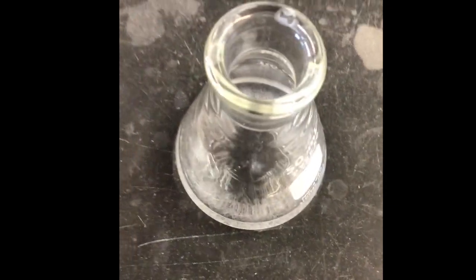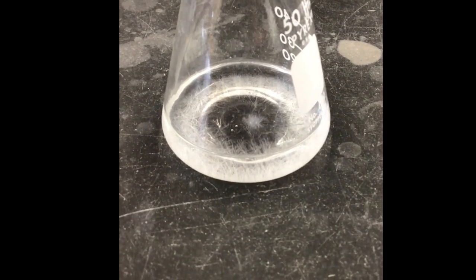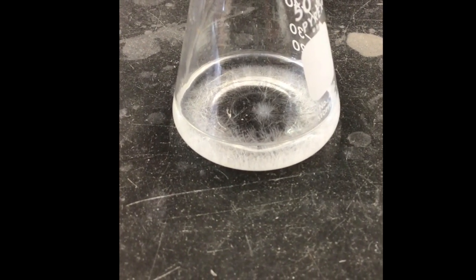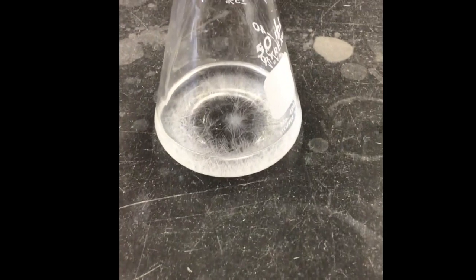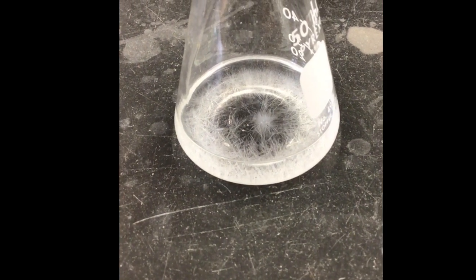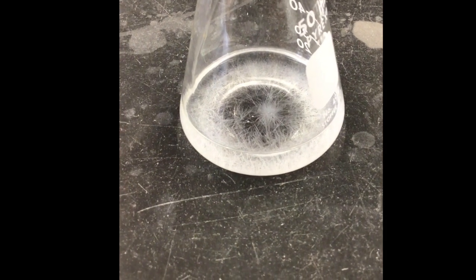Such cool needles. Not everything crystallizes in needle form. Obviously, if you've seen salt, it forms a certain shape, and sugar will probably form a certain shape. Water forms a certain shape, and so it just depends on the type of material. But needles are definitely a common thing for organic materials. Ooh, look at that. That's so cool. Love crystallization. I love just watching it. Sometimes you can see them just grow right before your eyes if you're looking more closely.